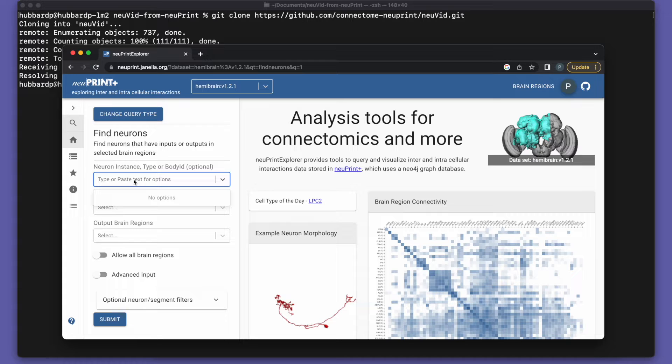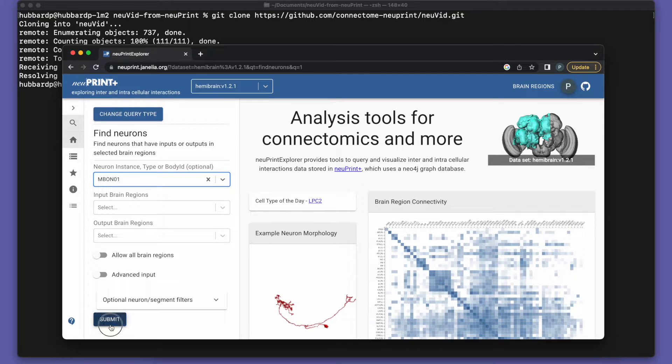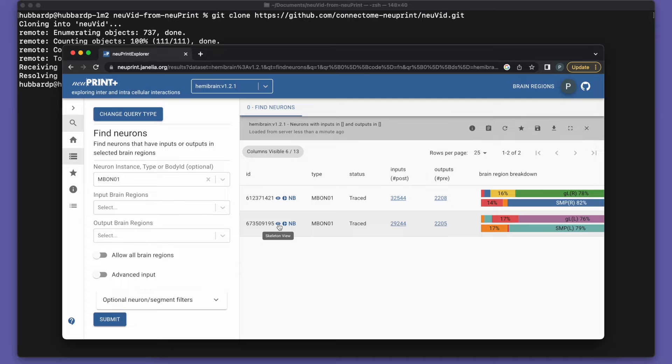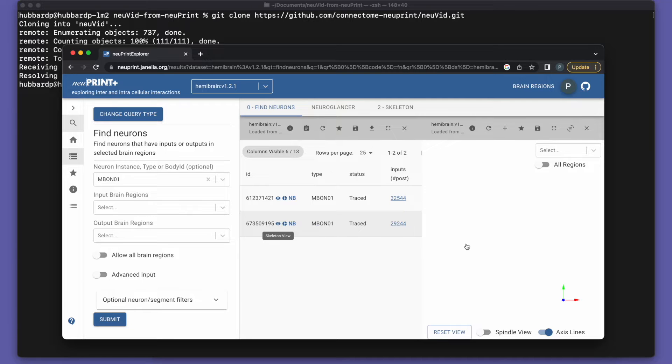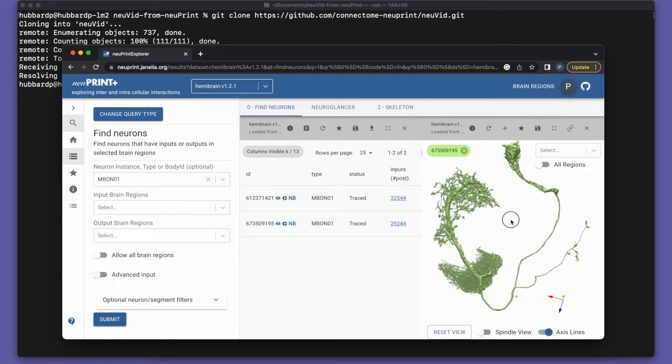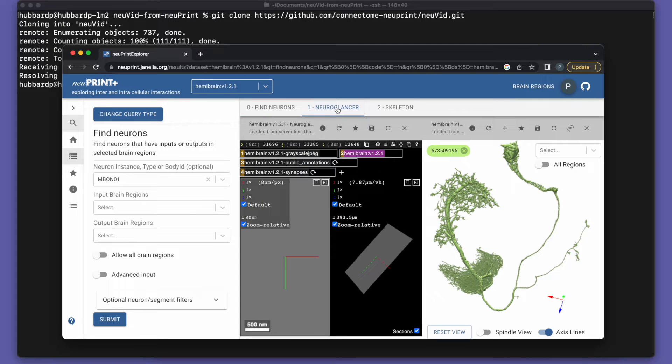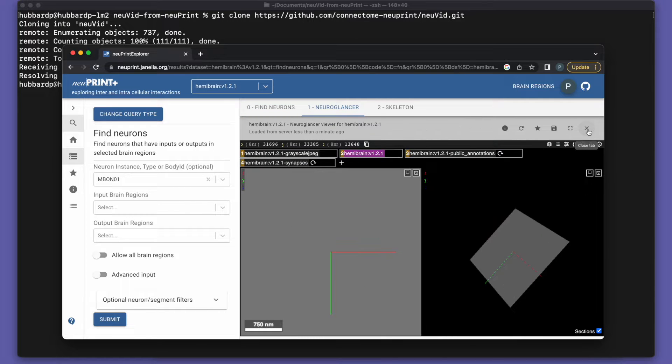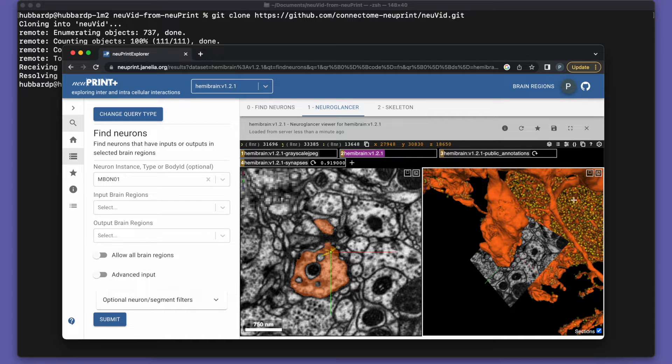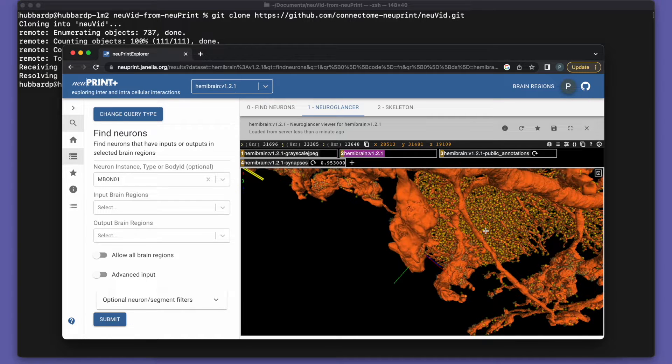I like the Mushroom Body Output Neurons, MBON, so we'll search for one of those. And then click on this little eye icon to see it. Comes up in the skeleton viewer, looks nice. But what we really want to do is see it in NeuroGlancer. So we'll switch to that tab and get the 3D view.